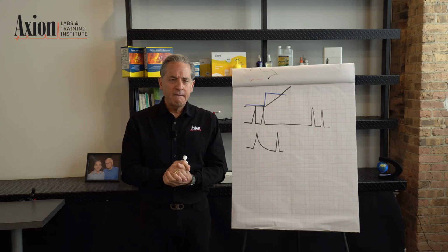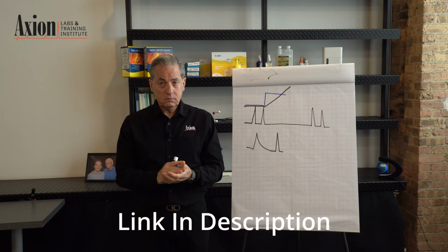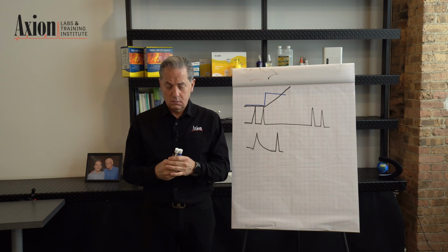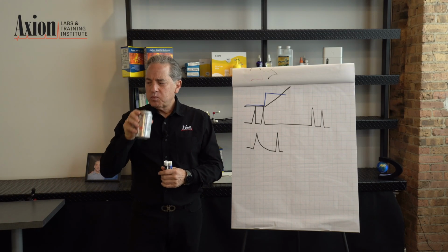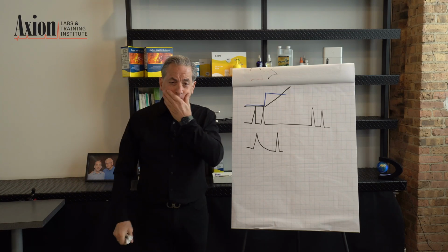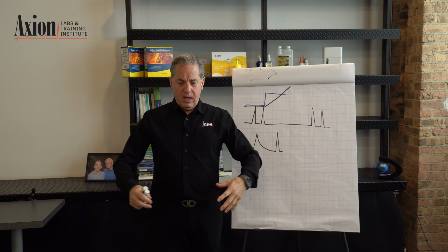Now, the next question, moving to GC this time, from our video GC Troubleshooting, the most common problems you will encounter. And they ask, what could be wrong if my inlet total flow falls when the oven temp is ramping up? I have changed the septum.